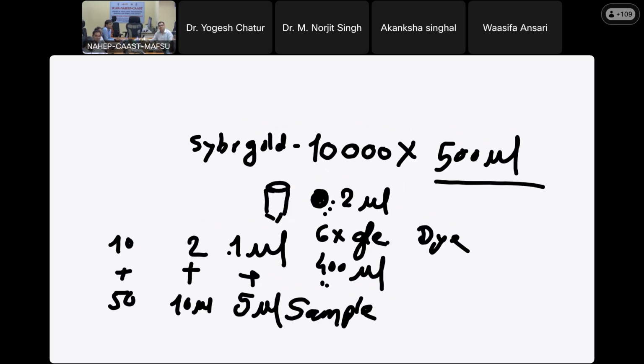Okay, the Sanger sequencing on a PCR is standard. The Sanger sequencing protocol is the same for any gene. So whatever protocol we set... Please write in the chat box, Yogesh sir. Thermocycler.